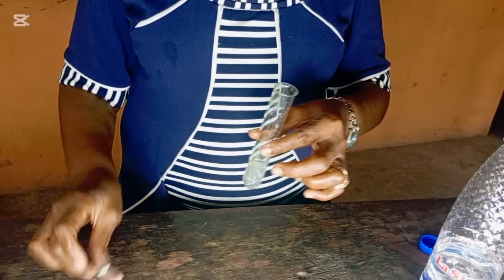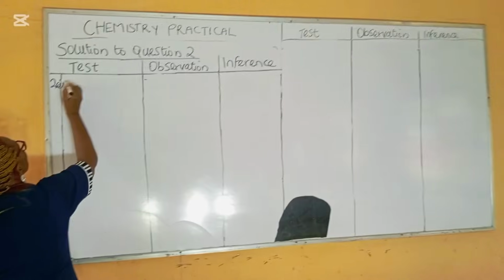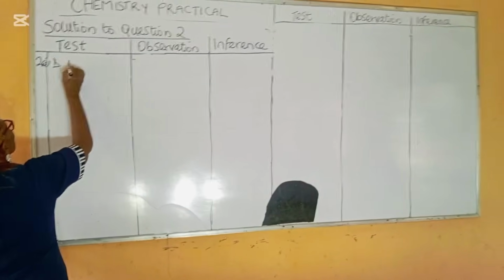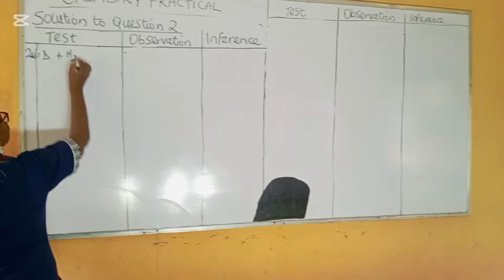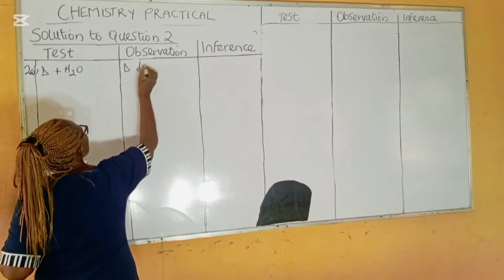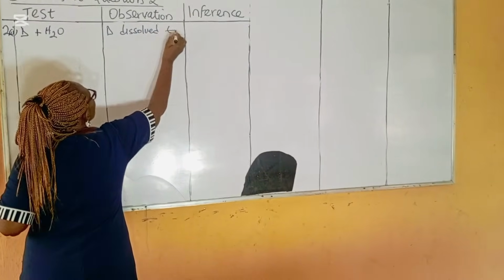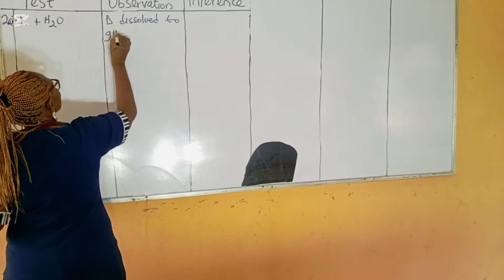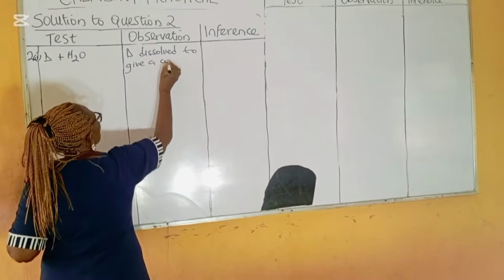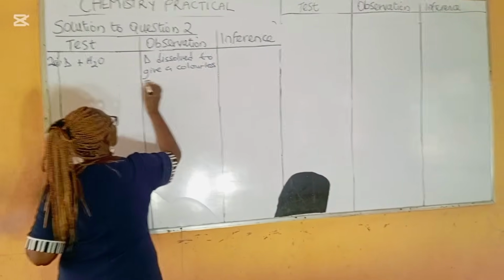Let's report first on what we have observed. D plus water. D dissolved to give a colorless solution.